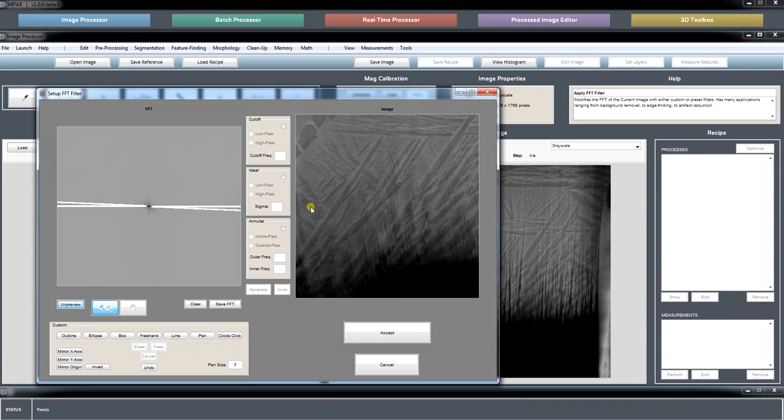It's almost magical sometimes when it works that well. It's just quite surprising what you can accomplish with image processing. You almost can recover intensity that you thought wasn't ever captured. So that's going to make finding those laths, those features, much easier.